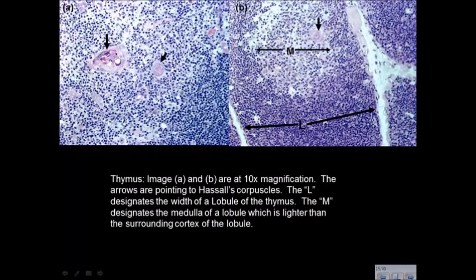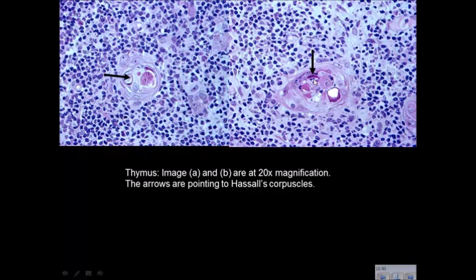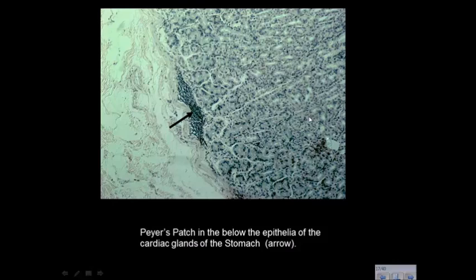Or the same thing. Is that the same? No, it's different. They're just downright ugly. Okay, weird. This up here looks like probably the stomach, because that's the mucosa here, stomach mucosa, and this is the submucosa. Mucosa again is the epithelial cells lining your digestive tract. And in the submucosa, you have a diffuse lymphatic tissue right there. It's either just cutting the edge of one or it's starting to get started. So this is your GALT or Peyer's patch.